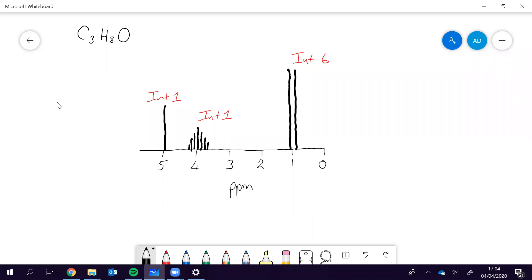Okay, so here we're going to try and work out the structure of this molecule with molecular formula C3H8O from its 1H NMR spectrum.